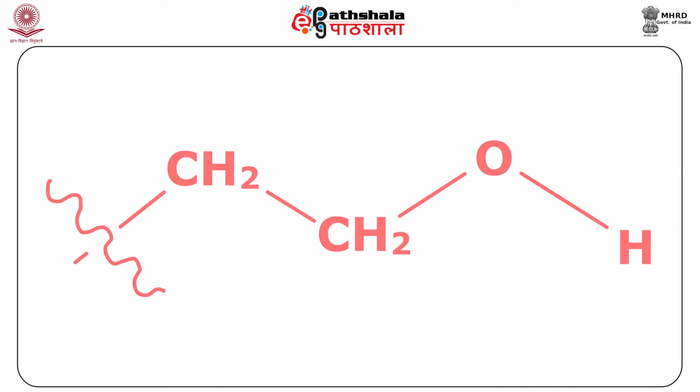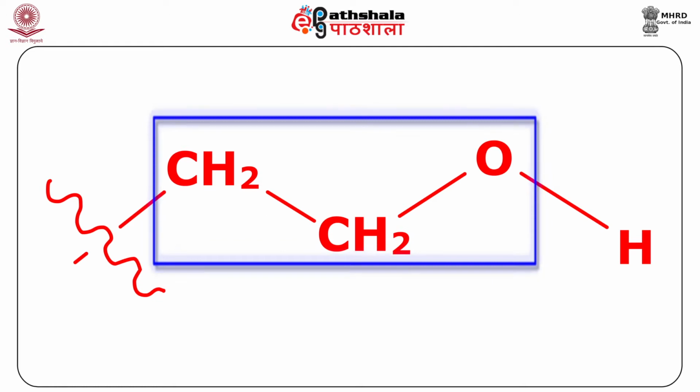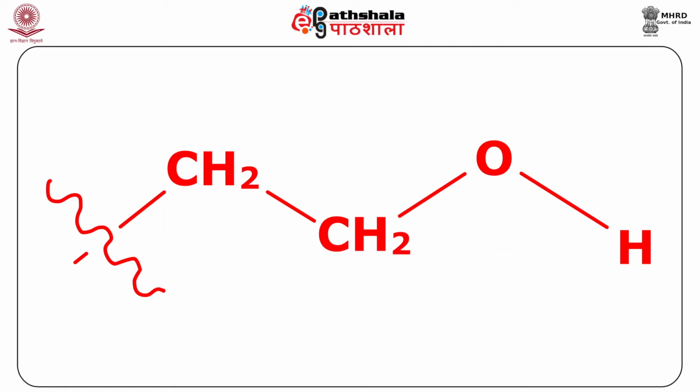Next, remember that the presence of a triplet at 3.9 ppm having 2 protons indicates the presence of a CH2CH2O group functionality, because you can only observe a triplet if the next carbon has 2 hydrogens. Remember that a peak at around 3.5 to 4.3 ppm is typical of OCH functionality as it is downfield.